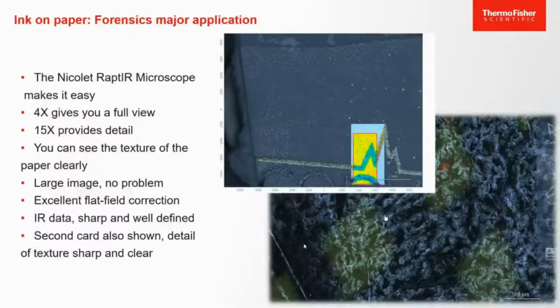On the right, just showing the quality of the visual imagery, this is from a business card. What was neat there was seeing the colors and the high degree of texture in that sample using the infrared material. So it's very sharp, very clear. And this is a huge part of choosing your FTIR microscope. You're going to want to have that visual clue or visual confirmation that you're looking at the right thing. So that is a look at some of the paper.